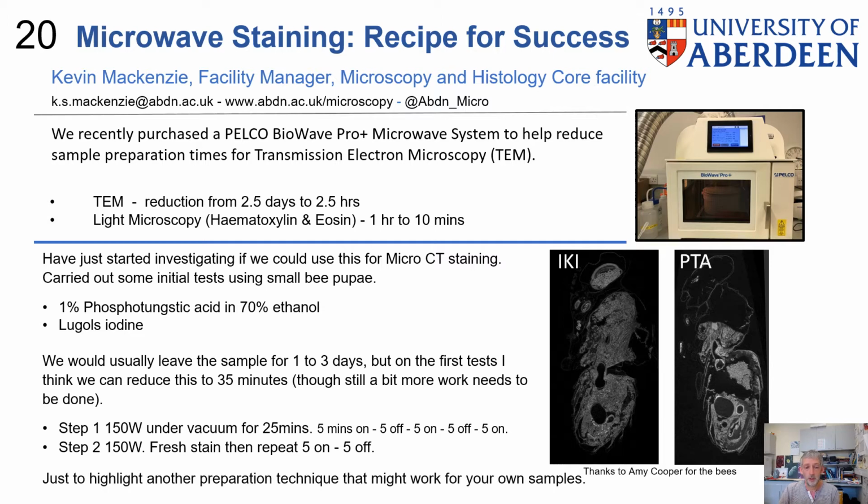So really, this is just to highlight another possible preparation technique that might work for micro-CT samples. And I'd like to say thanks to Amy Cooper for supplying the bees, and thank you.